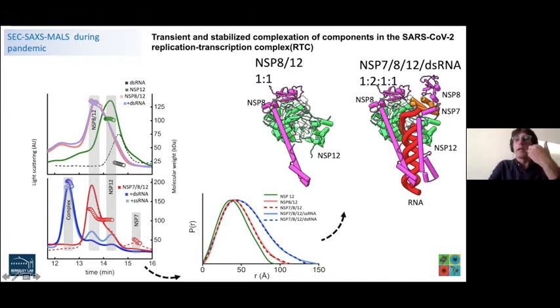Luckily, the cryo-EM came a couple of weeks before we had access to this data. So this good combination told us multiple stories about how the machinery works, why DNA is not binding, where RNA is supposed to probably bind, and confirmed most of the cryo-EM structures. That was one of the happy stories.